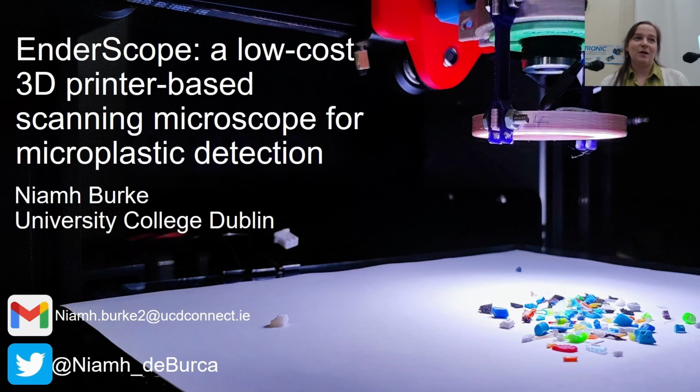I'm going to talk about the EnderScope project. This is an open source, low-cost microscope that we've made. And I recognize there's a lot of people here who are very passionate about open hardware. So I don't need to preach to you how good open hardware is. So I'm not going to. Instead, I'm going to talk about the process of how we put this microscope together, what we learned throughout the process, and mistakes we made and tips.